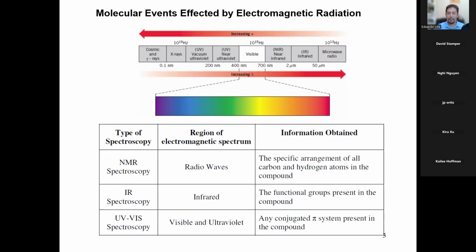For infrared, we use IR. Like I mentioned, we can use it for remote controls. Visible and ultraviolet, they have their own spectroscopy. We call that UV vis, like ultraviolet visible. We did an experiment in 111B with UV vis. If you guys remember, we were putting the stuff in the instrument and we had to take the measurements and we had to measure absorbance and so on. All of that was UV vis spectroscopy.